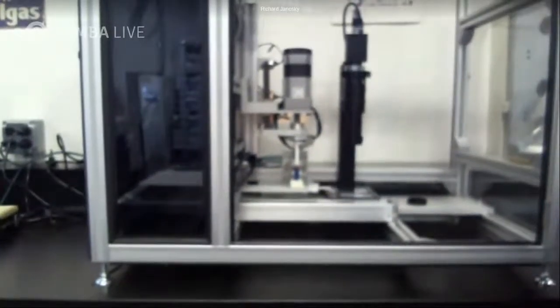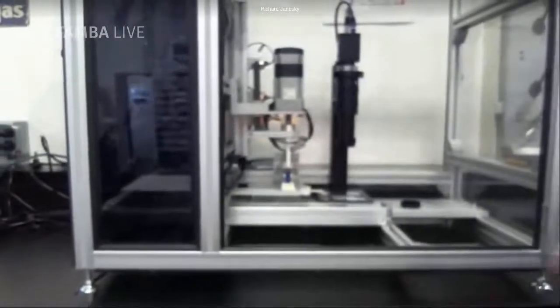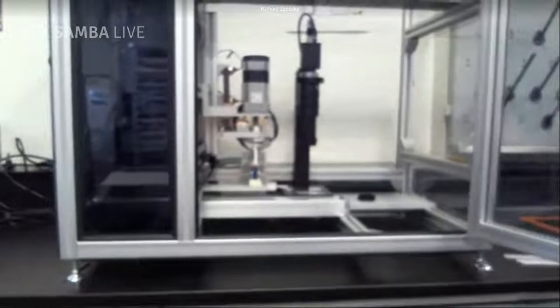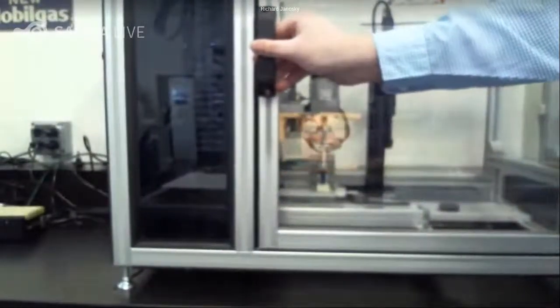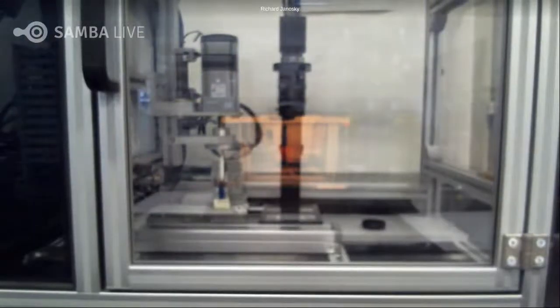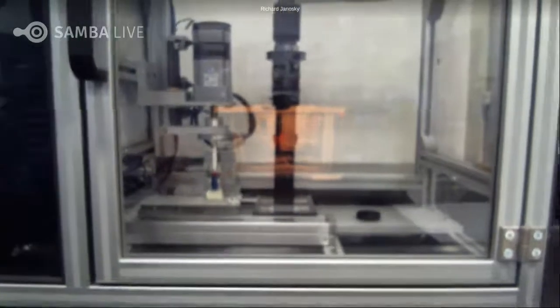And then on the screen, I'm going to wait for the temperature to hit the correct temperature to start the test. Sorry about that movement. There's a safety feature. The door has to be closed on the instrument to be able to perform a run.